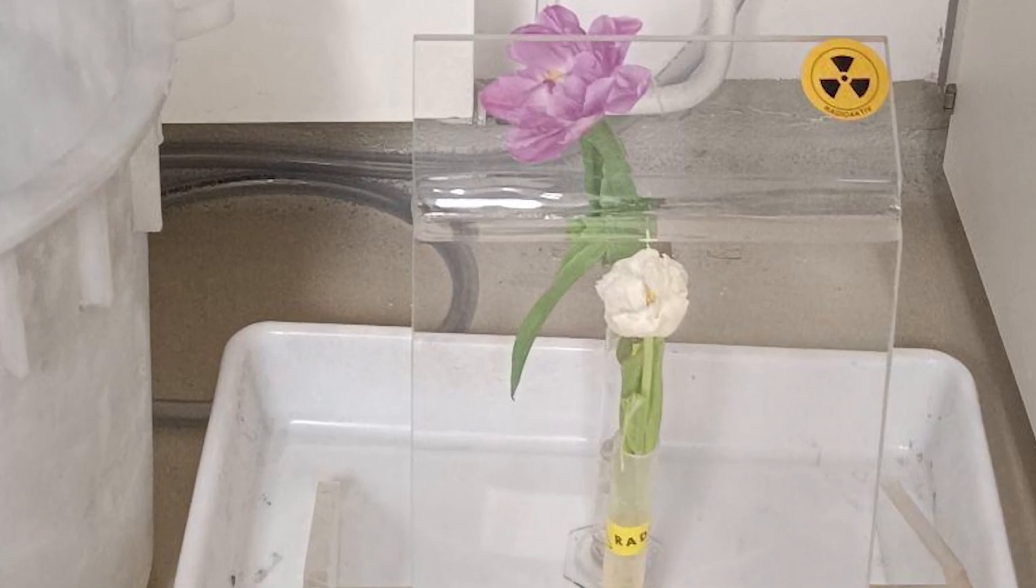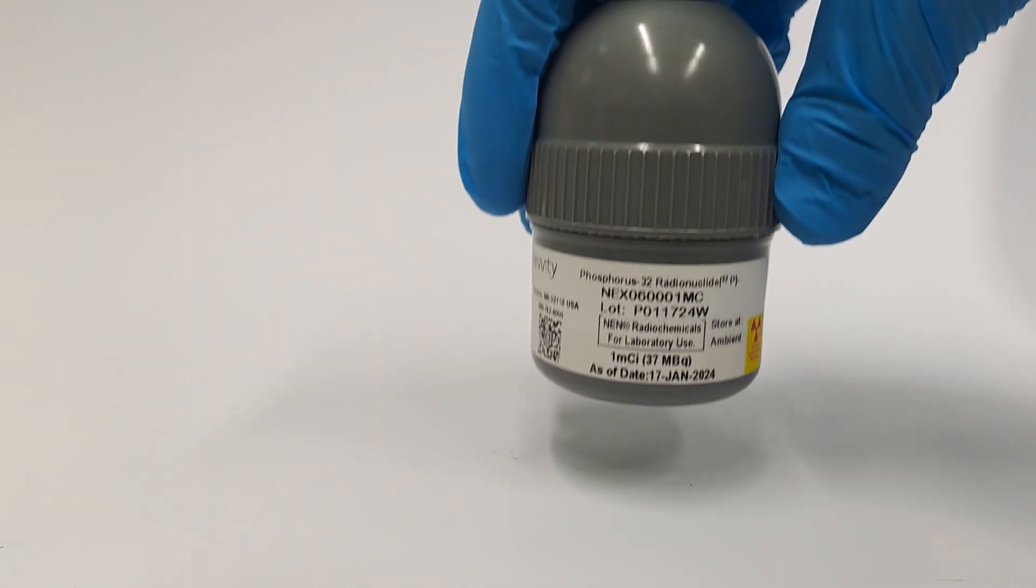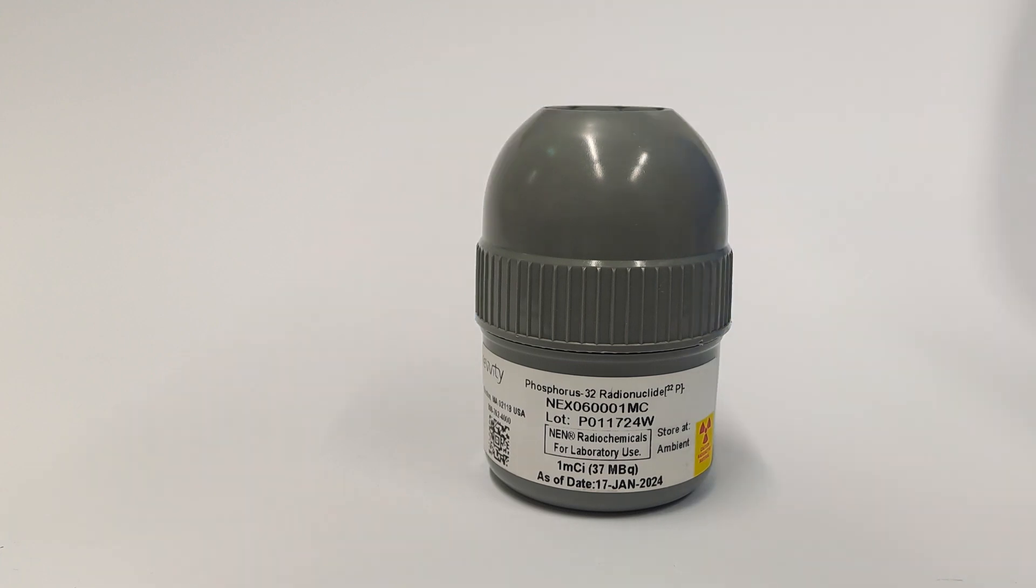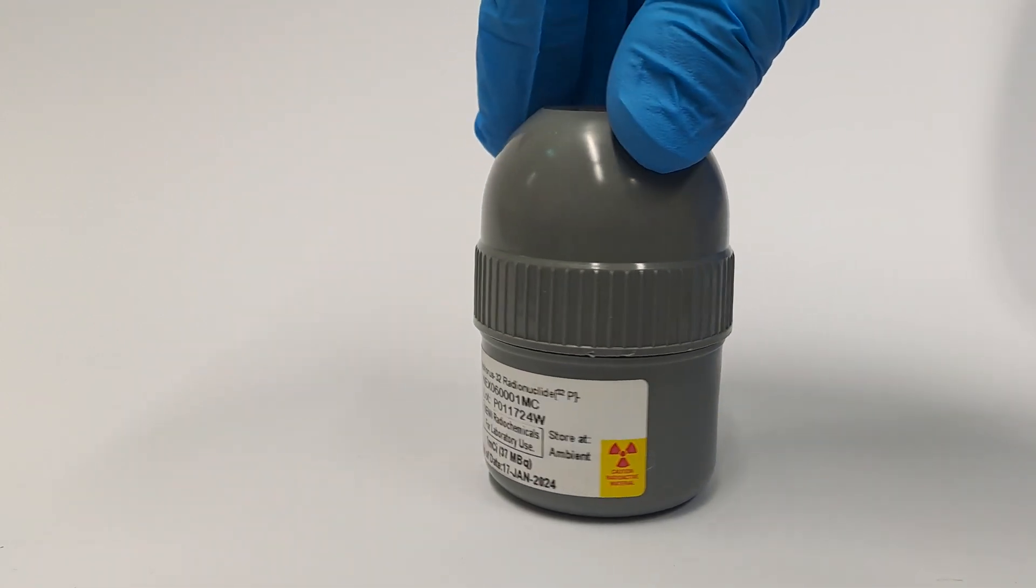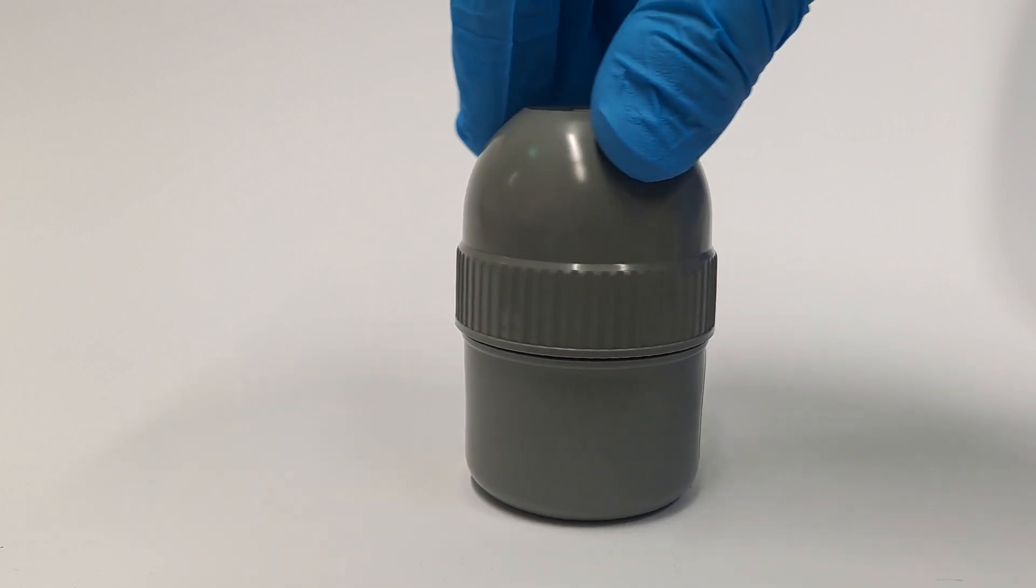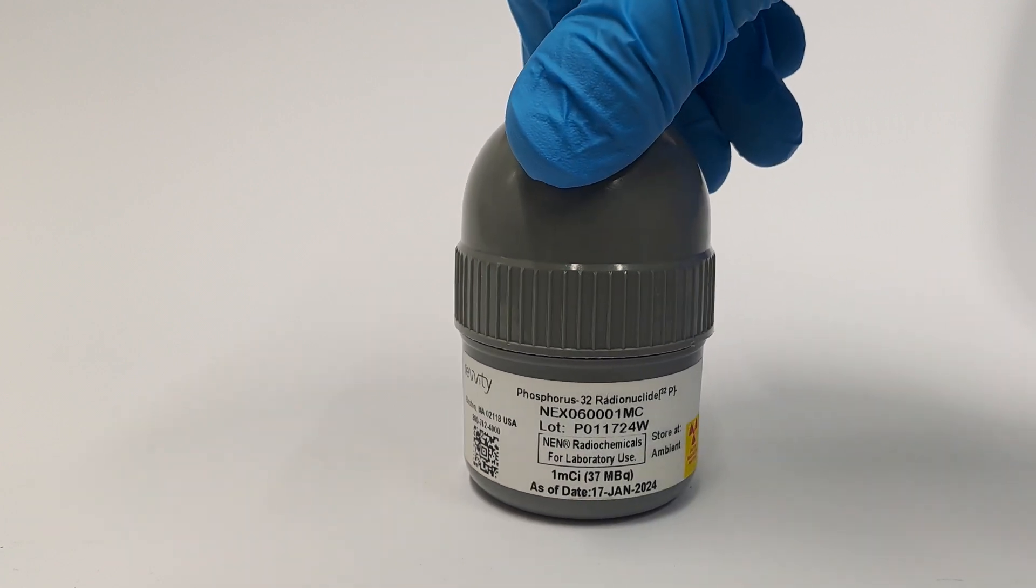Today, a flower is being made radioactive. Why? Because we received a fresh batch of phosphorus-32 in the form of potassium dihydrogen phosphate, and I wanted to investigate whether certain regions of a plant retain more phosphate than others.